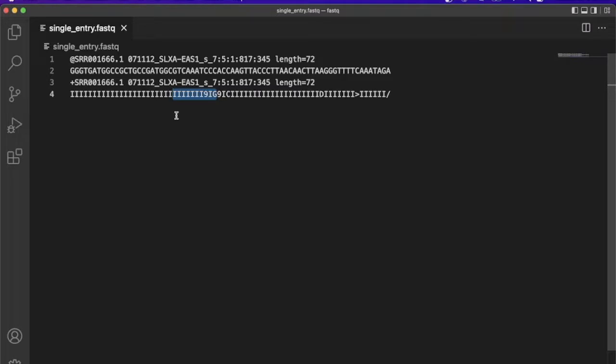Okay, so how do you do this? Let's go through an example and find the probability that the base call for the first base, in this case G, is incorrect, working our way back from the quality score of I. First, we start off with the equation to calculate the quality score, which is Q here, but remember we want to calculate P, the probability that the corresponding base call is incorrect.